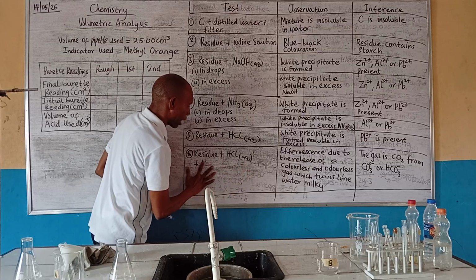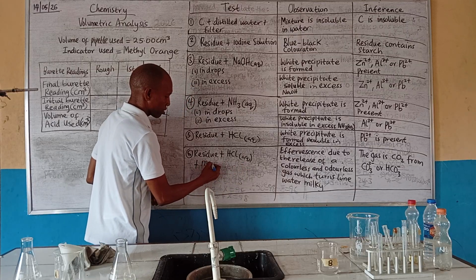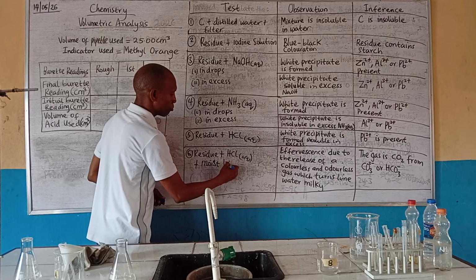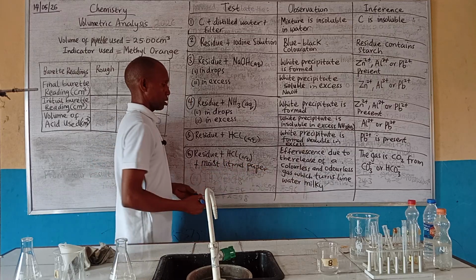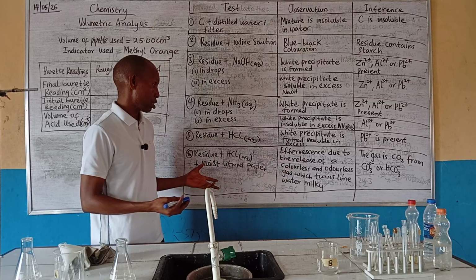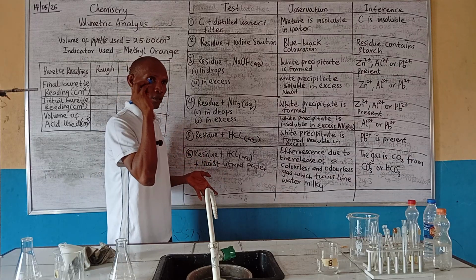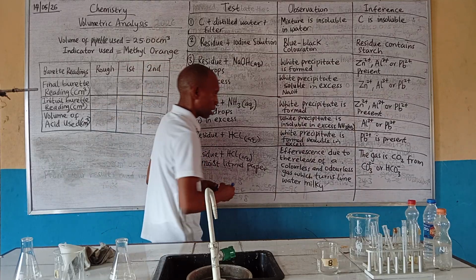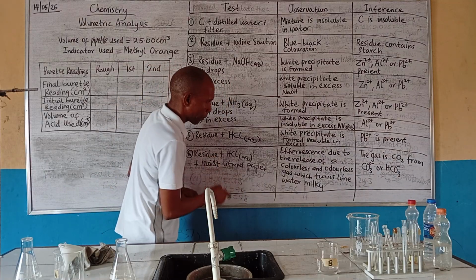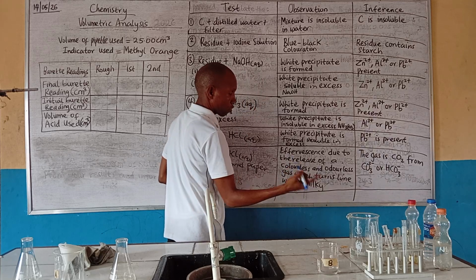But in place of lime water, if you are asked to use moist litmus paper, that means they want to find out if the gas is acidic, neutral, or basic to litmus. Now, if you have to use litmus paper, that means you can add to the list of adjectives here.